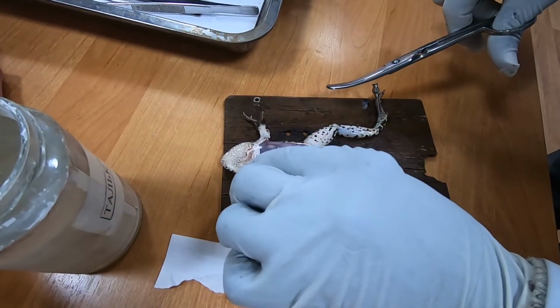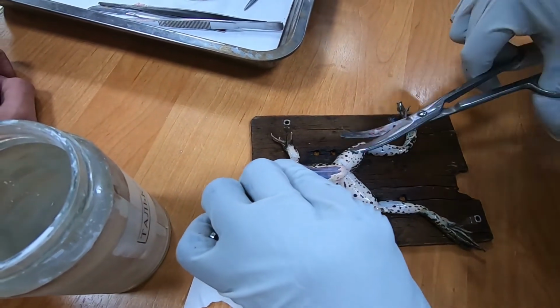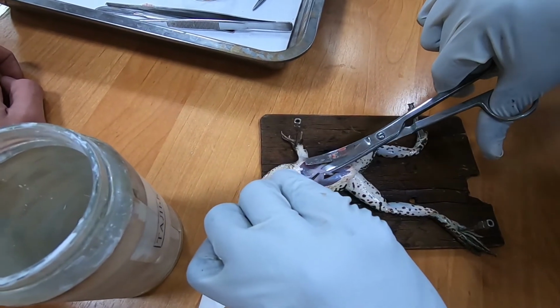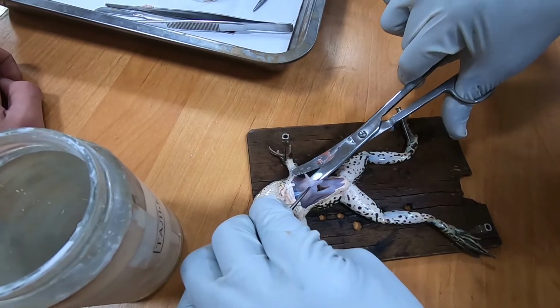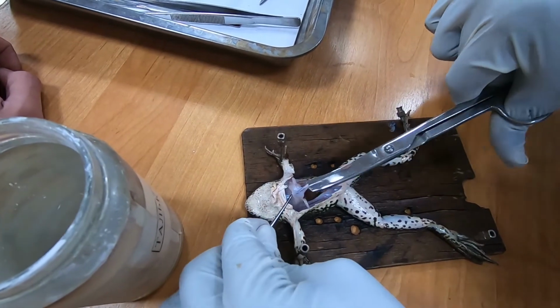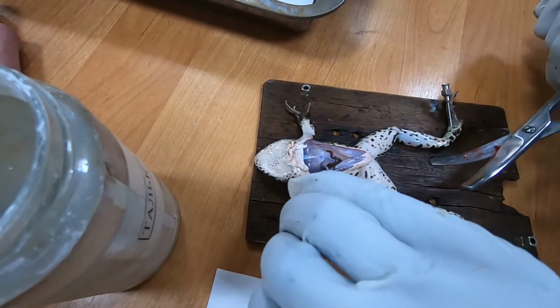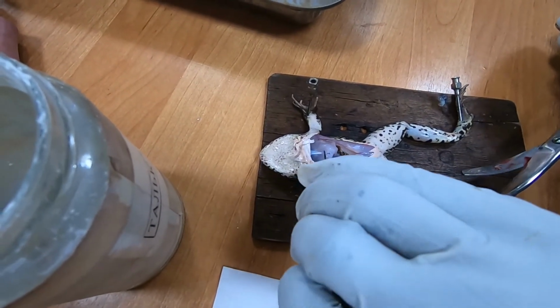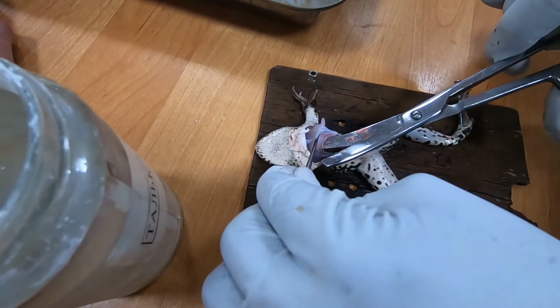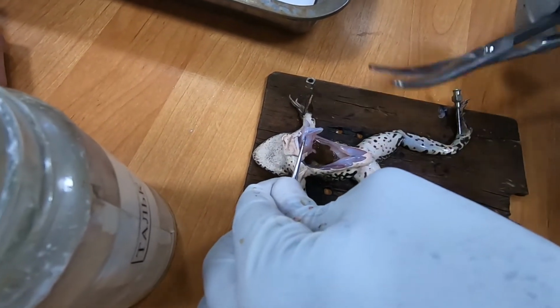Take off the skin. And then now we have to expose the heart. Now this is how surgeons carry out their work. So now we're dealing with just small animals here. Later we're going to work with much bigger animals, but our practice starts from much smaller animals.